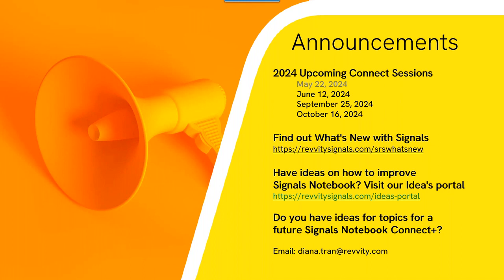Thank you. We have Signals Notebook, but no data processing. How do we get access to that functionality? Yeah. So again, just to level set, we showed in the beginning things for people who have Signals Notebook and know what that is. You saw a lot of the functionality that you're used to.